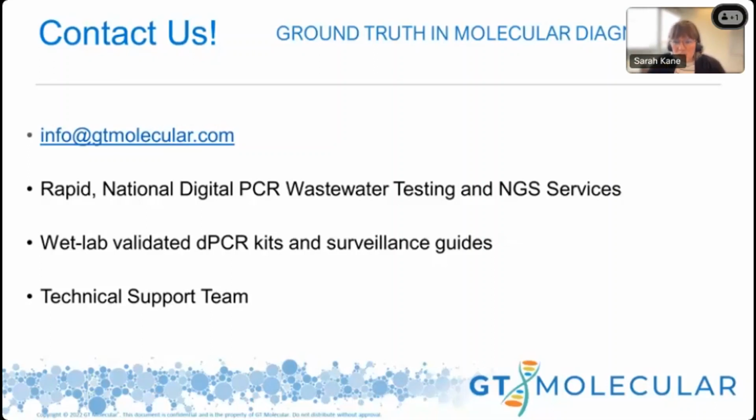Oh, it looks like David says, we've also been looking for one as well. I think it's interesting that the concentration beads from Ceres or from the MagMax kit can concentrate more than virus. Yeah, absolutely. So I was talking to Lauren Saunders at Ceres just a couple weeks ago, actually, and she said that a lot of bacterial targets do get concentrated with the microbiome A particles. And there's just a subset of bacteria that need the microbiome B particles.